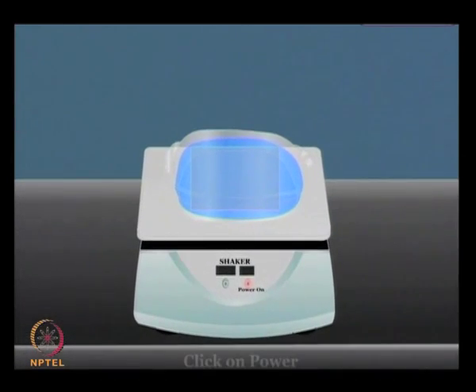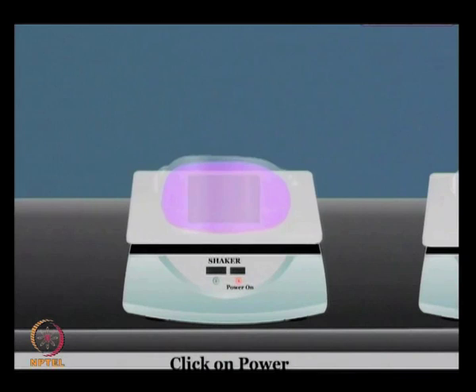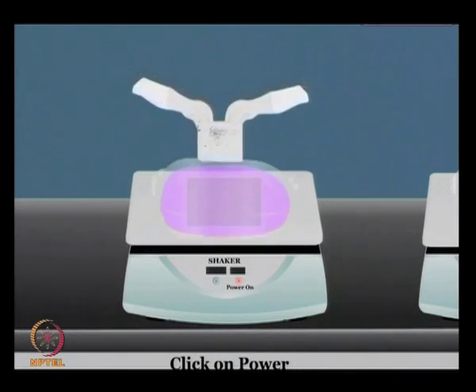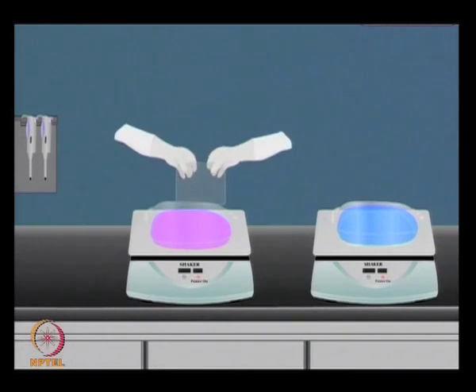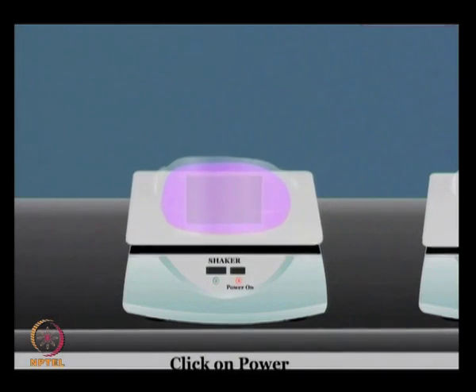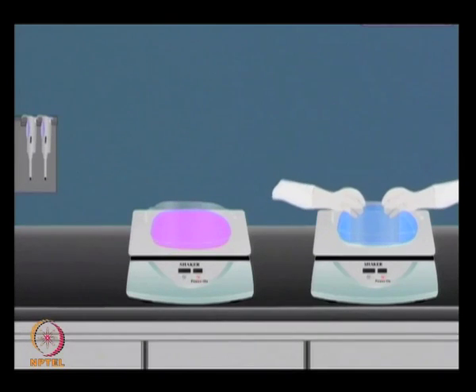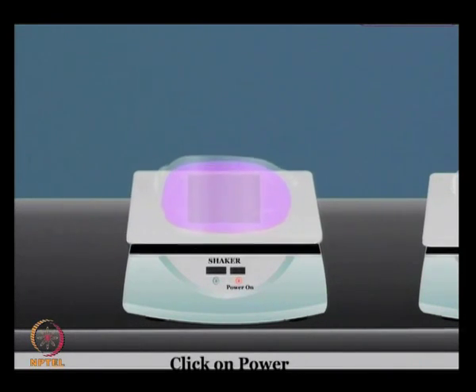So, this process involves removal of the gel from the electrophoretic assembly, followed by treatment with a fixing solution, staining solution and finally, the de-staining solution. You need to ensure that proper shaking conditions are maintained, and you need to allow 10 to 14 hours, usually an overnight step, for the staining as well as de-staining steps. After de-staining is done, then you can see protein spots on the gel with a very clear background.